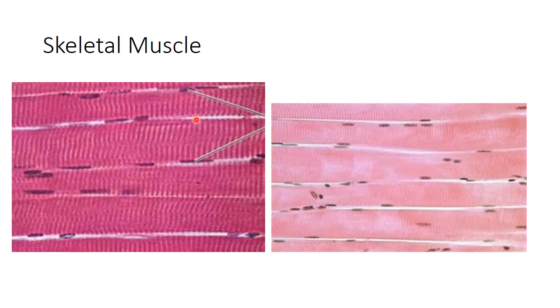Then we have skeletal muscle. It's also known as skeletal muscle fiber. Here's the stripes cutting across, striation. You're actually seeing the proteins that make up that particular tissue. It's called actin and myosin. See these little black speckles? And the little black speckles are what? Those are the nuclei. There you go.